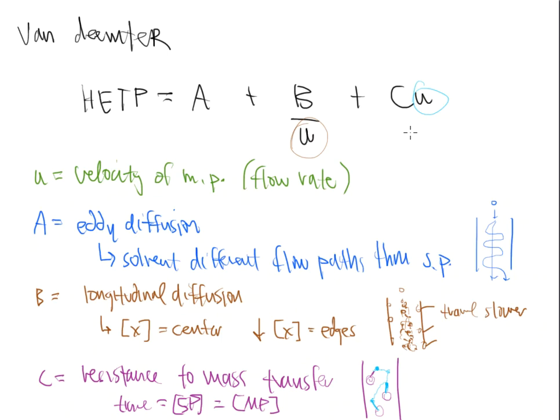The speeds never get affected. We're simply talking about a different path. So imagine the interstate and the back roads having the same speed limit, because in chromatography, it kind of does. It doesn't matter if you're taking the long way or the quickest way as far as distance goes. You're traveling at the same speed. And that's why we never see U assigned to the A variable in the Van Deemter equation.